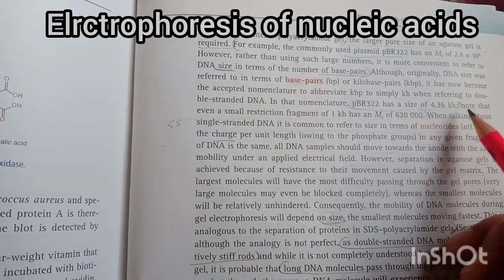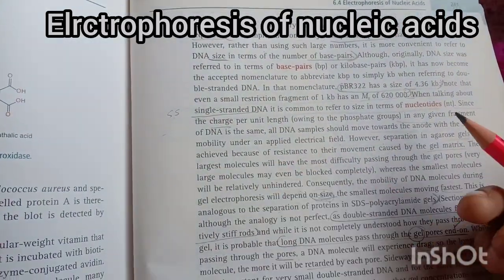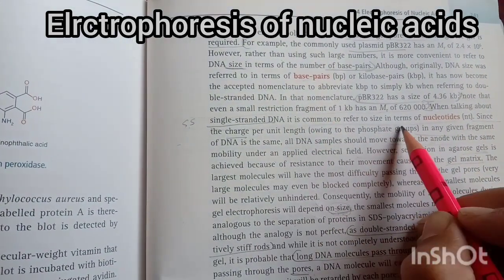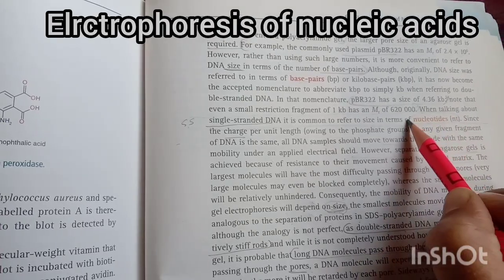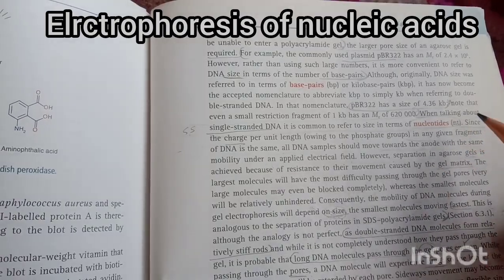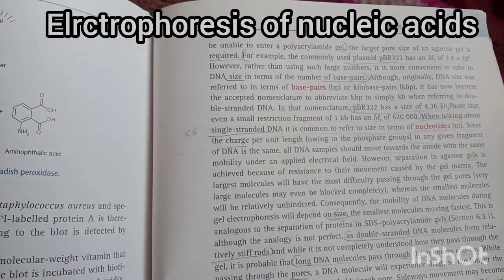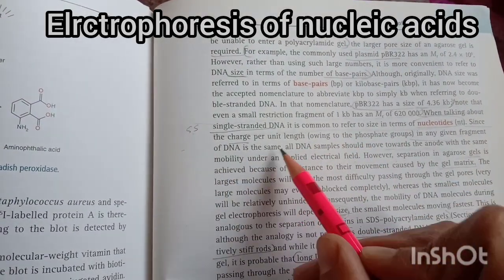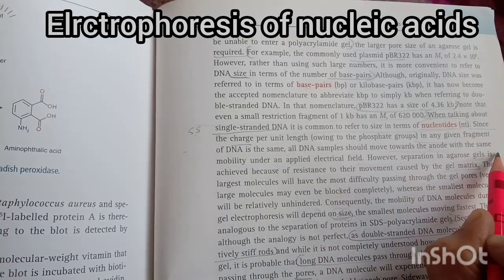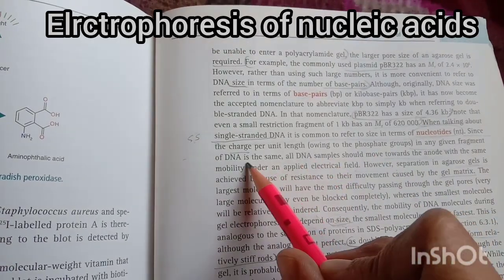Now we talk about single stranded DNA, next we will study double stranded DNA. Single stranded DNA is commonly differing in size in terms of nucleotides. We all know that the charge of DNA fragments is all the same, so we cannot separate them on the basis of charge. All the DNA will move toward the anode at the same speed. So there is a difficulty to separate because they have the same charge.